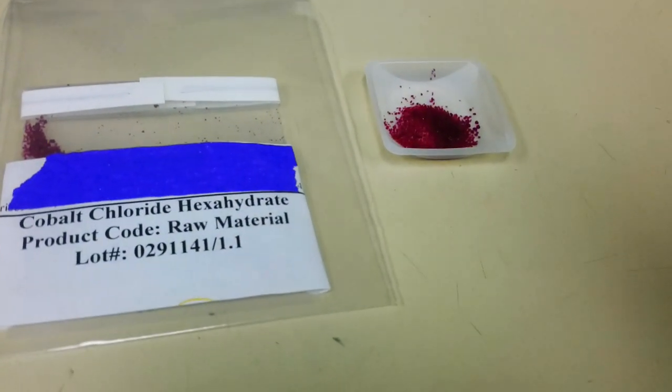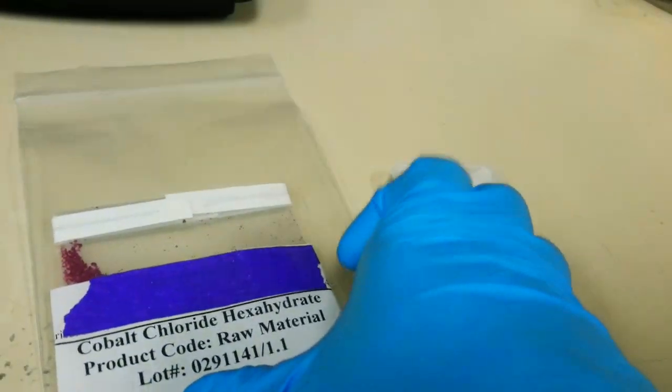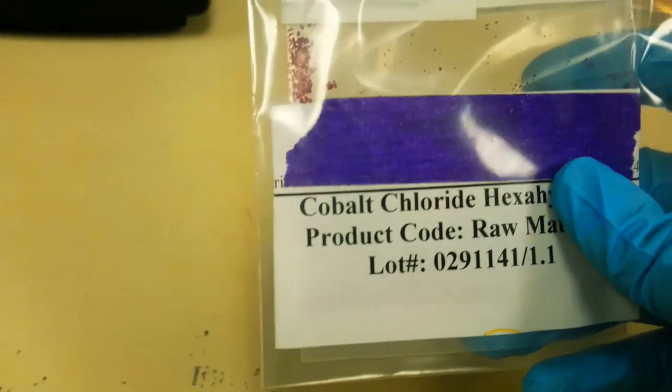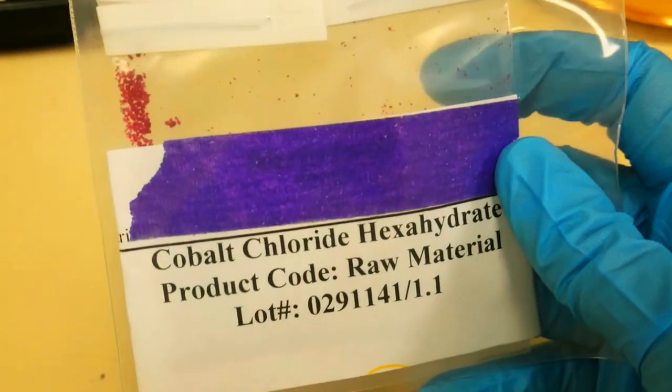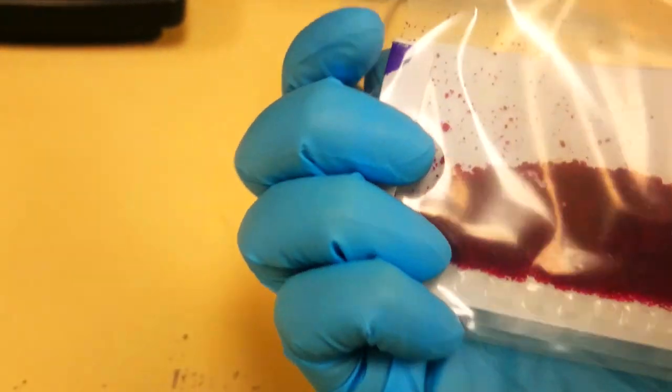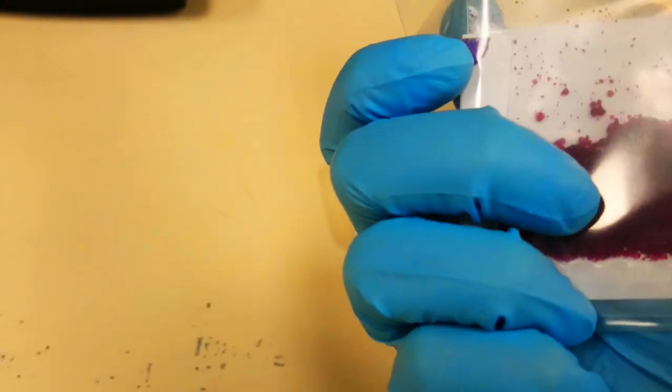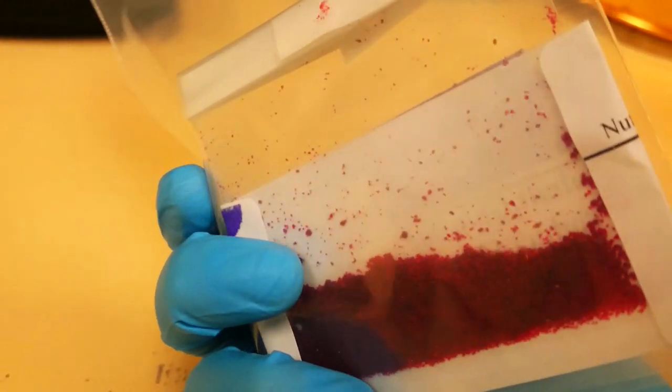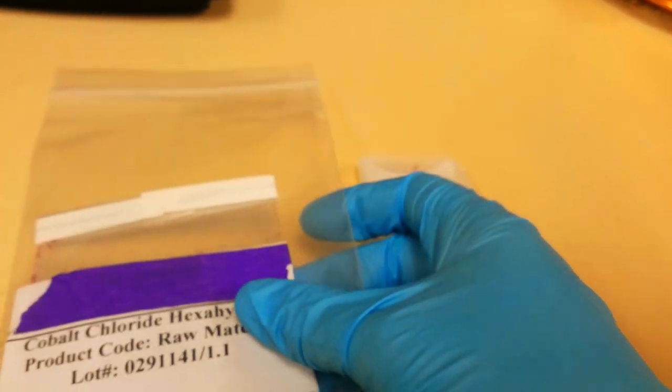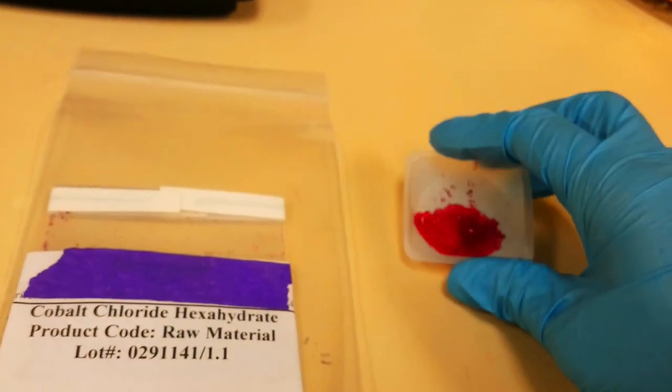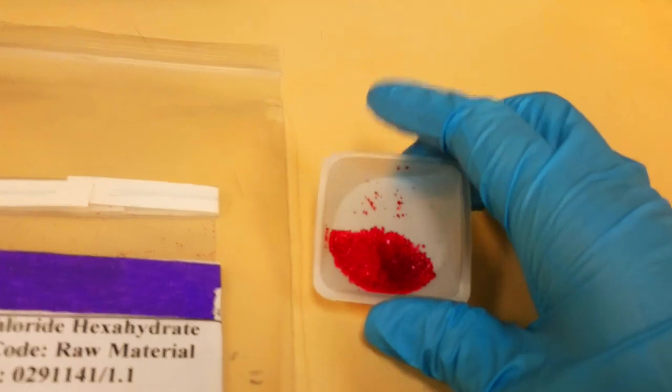This other material is a cobalt chloride hexahydrate. This one is crystalline granules. It's a lovely pink color.